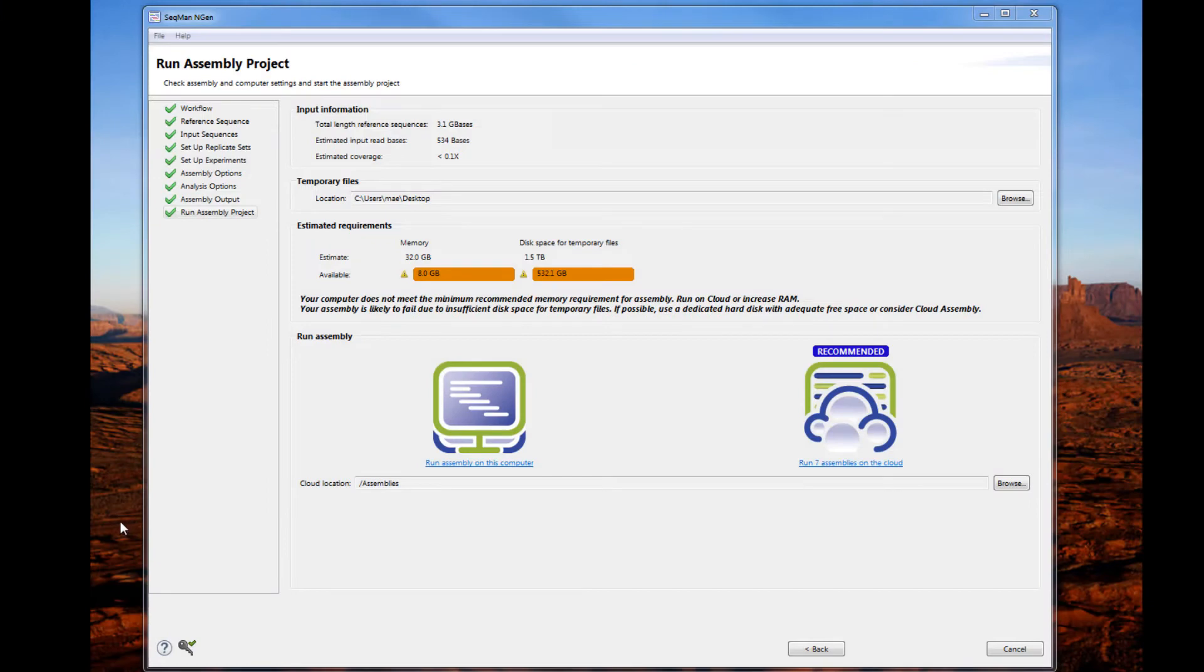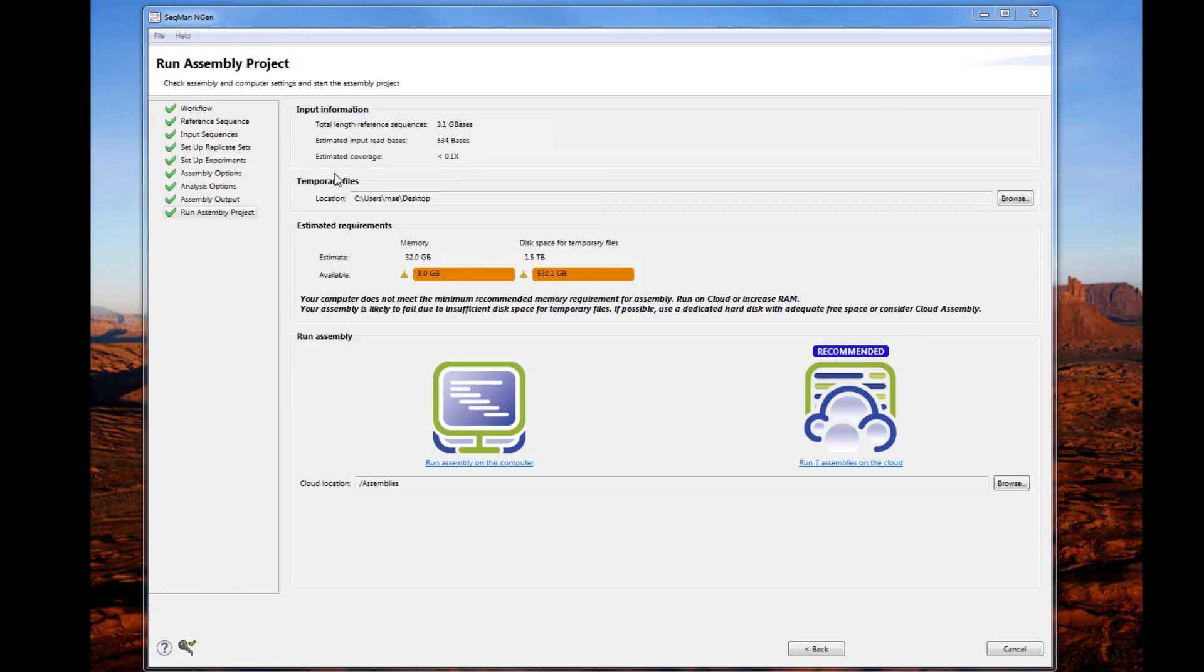Finally, SeqMan Engine automatically analyzes your input data and hardware and lets you know if your system can handle the assembly locally or if you should run it on the cloud. Every free trial and purchase of Laser Gene Genomics includes five free DNA Star cloud assemblies. Additional assemblies are available to purchase online.